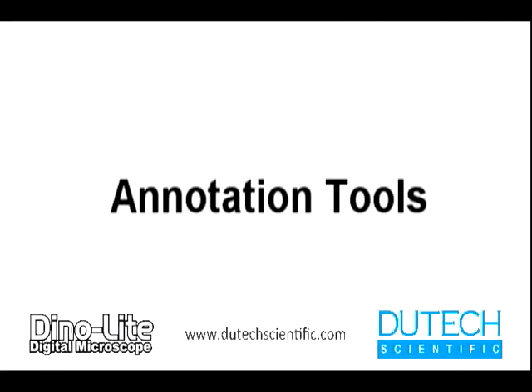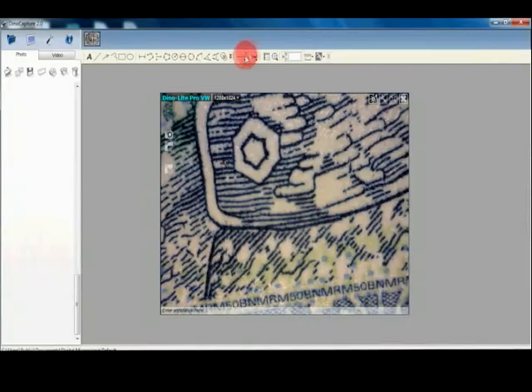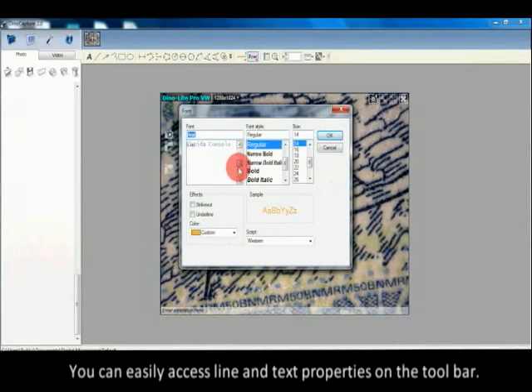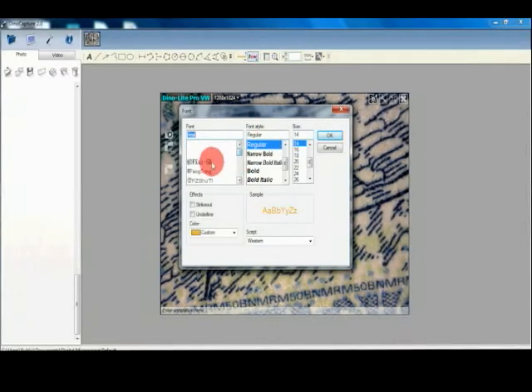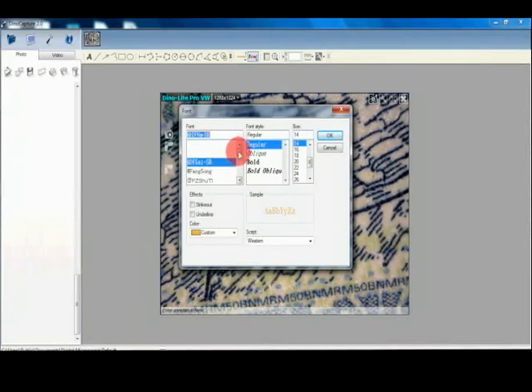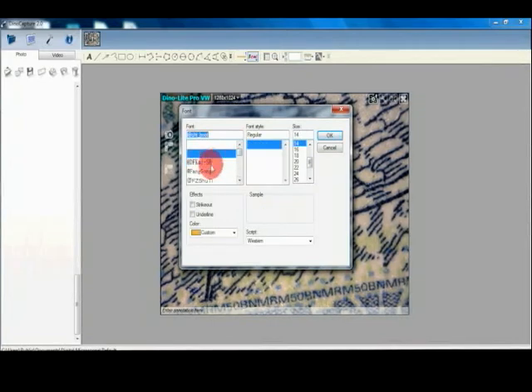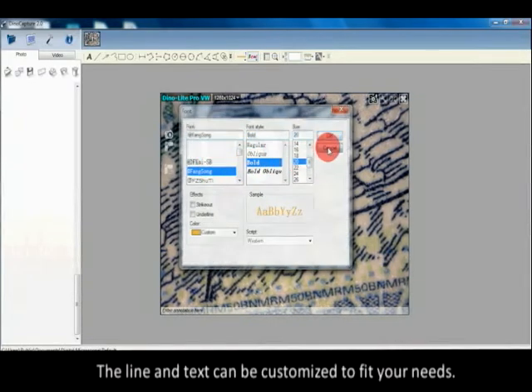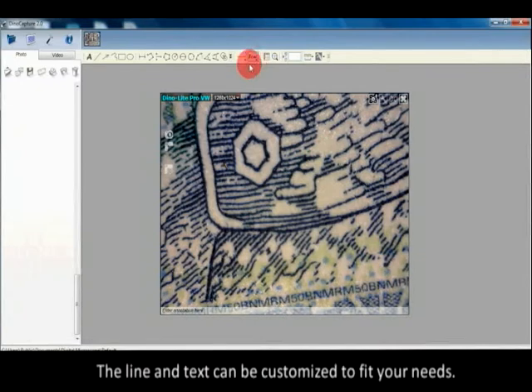Annotation tools: You can easily access line and text properties on the toolbar. The line and text can be customized to fit your needs.